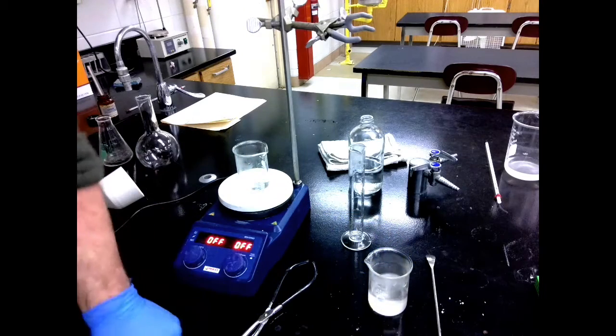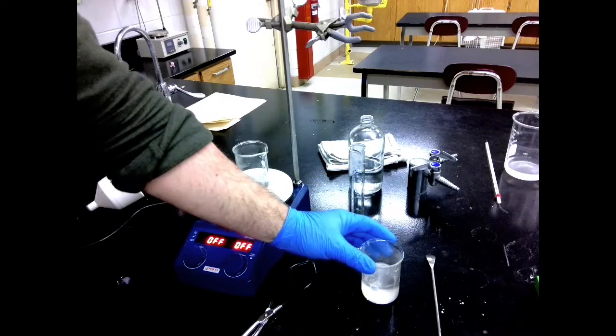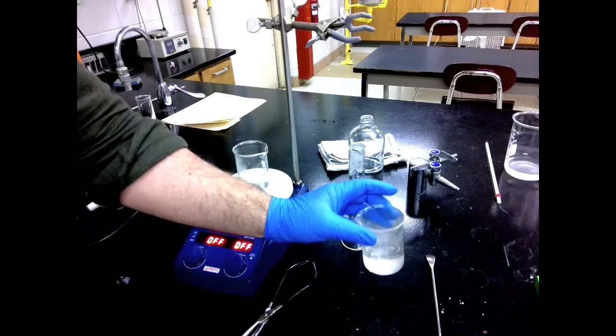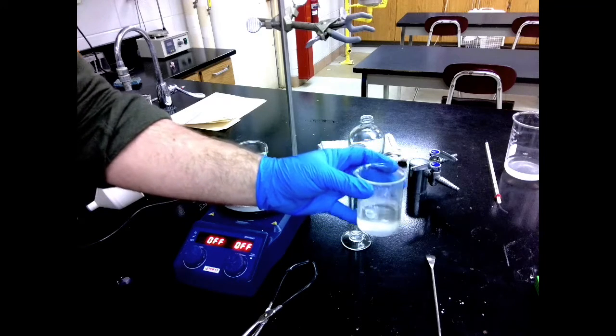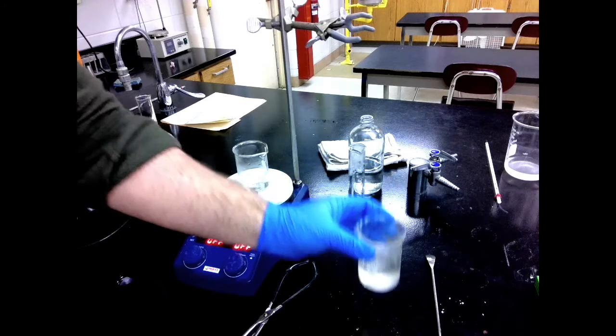So now my final step is going to be to cool this down again. So I need to put this back into my ice bath or my fridge or whatever we're using to keep it nice and cold. So we want to get this back down to as low of a temperature as possible, and then we're going to filter it one last time.